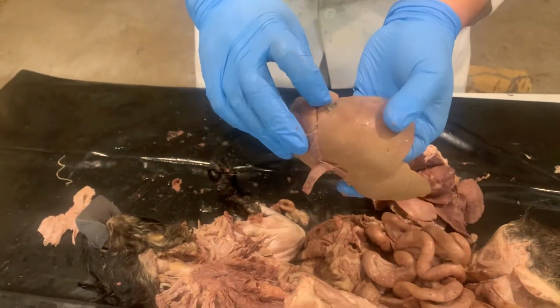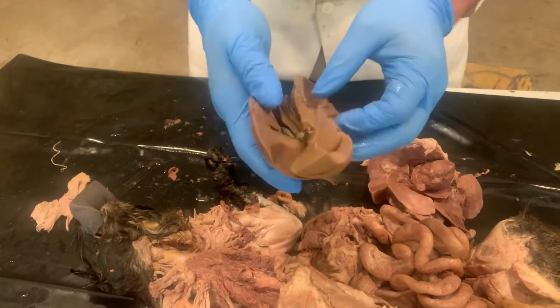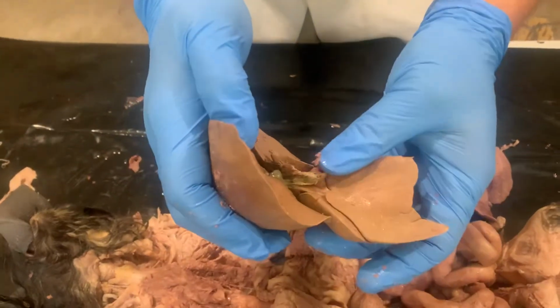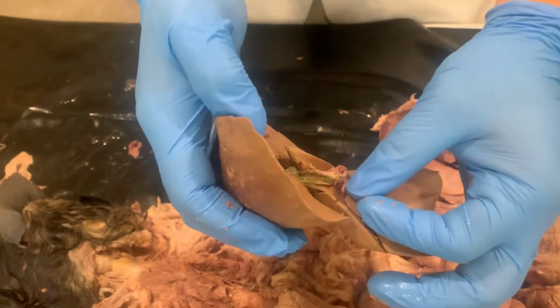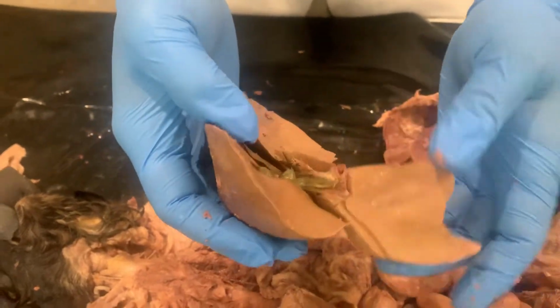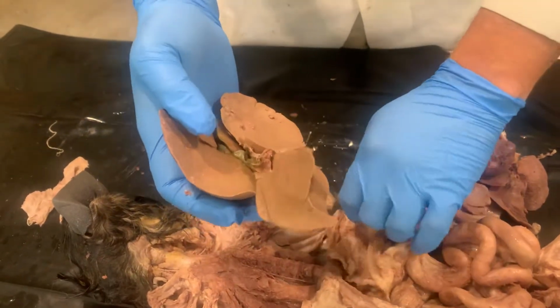liver. You have your gallbladder, which is in between the lobes of the liver here. Down here, you're gonna have the bile duct and the hepatic arteries that are going into the gallbladder. You can tell it's the bile duct because it's the green opening. Hepatic artery is gonna be that nice big open hole. So that's where the liver is gonna get blood.